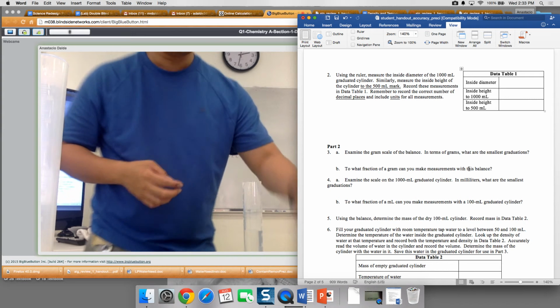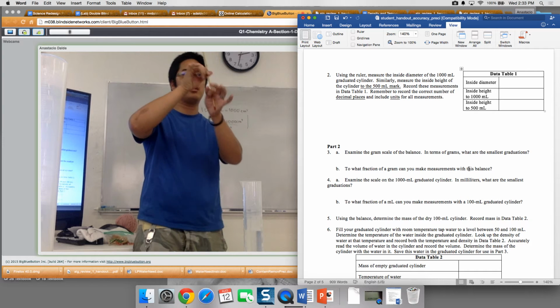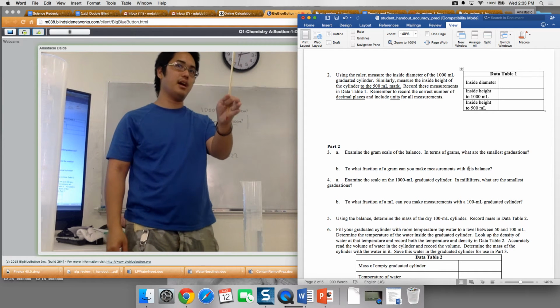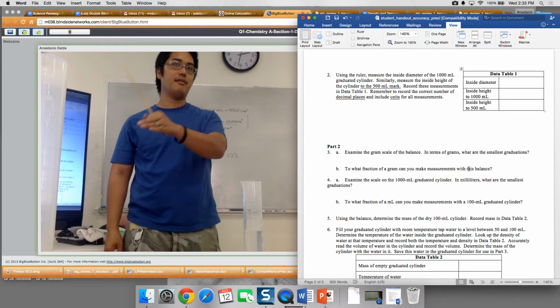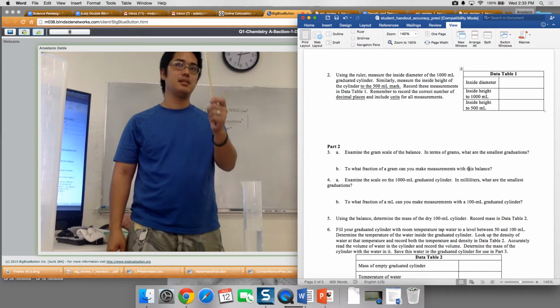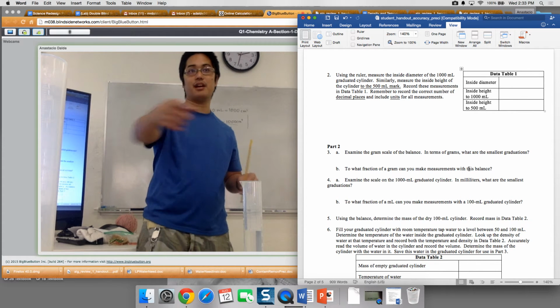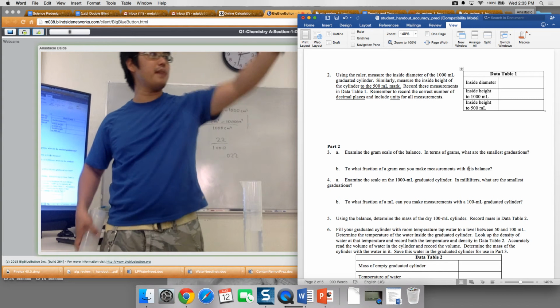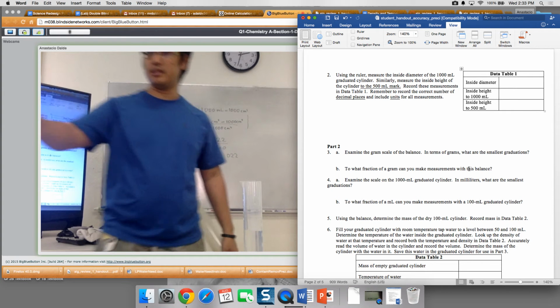Oh, and I think somewhere in the directions, I want you to measure the temperature of the water, because the temperature that you read your water at is going to change the density of the water that you actually have. Does that make sense? Yes? No? Yep. And I showed you guys just on that website how to look up the density of water. You're going to need to get your water from back there. Here's an extra rock if someone wants. It fits in the small one.